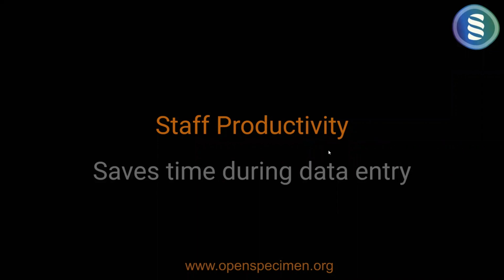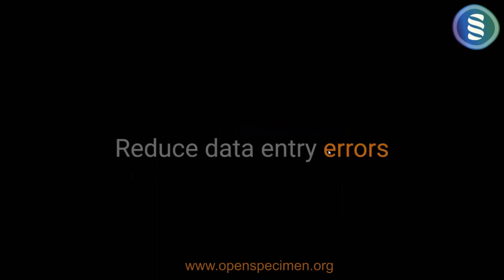So that's the payback: the investment you make in the mobile app should be repaid over time, because it saves a lot of your end users' time. And anything that is easier to do and takes less time also automatically reduces data entry errors.